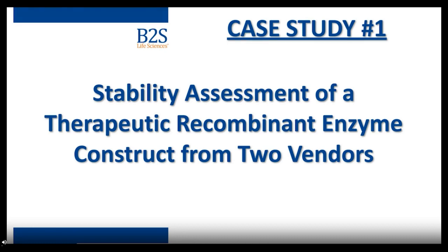So today we're presenting 2 case studies where the Uncle instrument has aided our characterization through advanced characterization methods, what those outcomes were, and key learning points from each case study. So the first case study examines the advanced characterization of one enzyme, which was produced and provided to us by 2 vendors. We had reason to believe that the 2 isozymes differed in biochemical behavior and warranted a closer look.